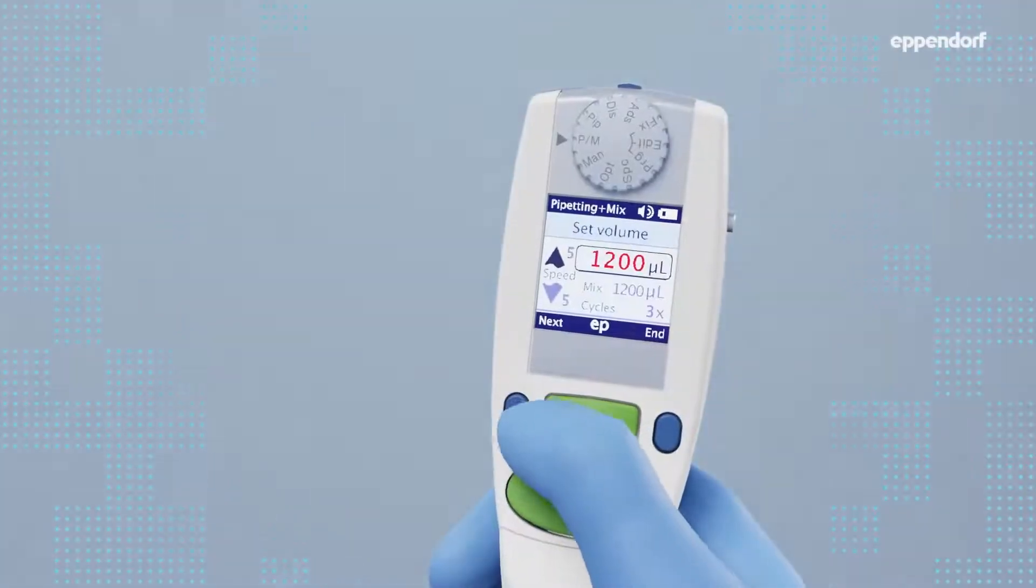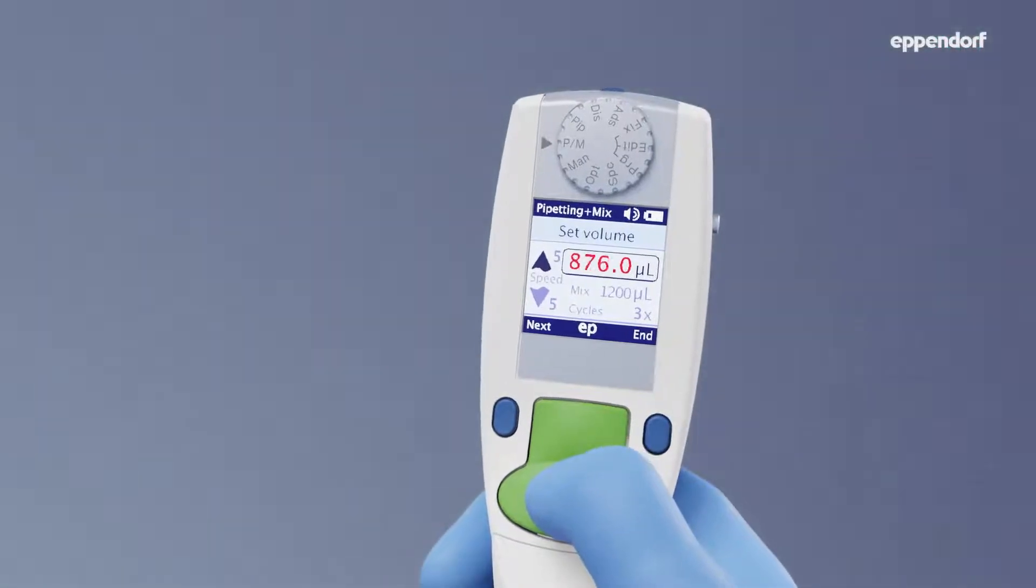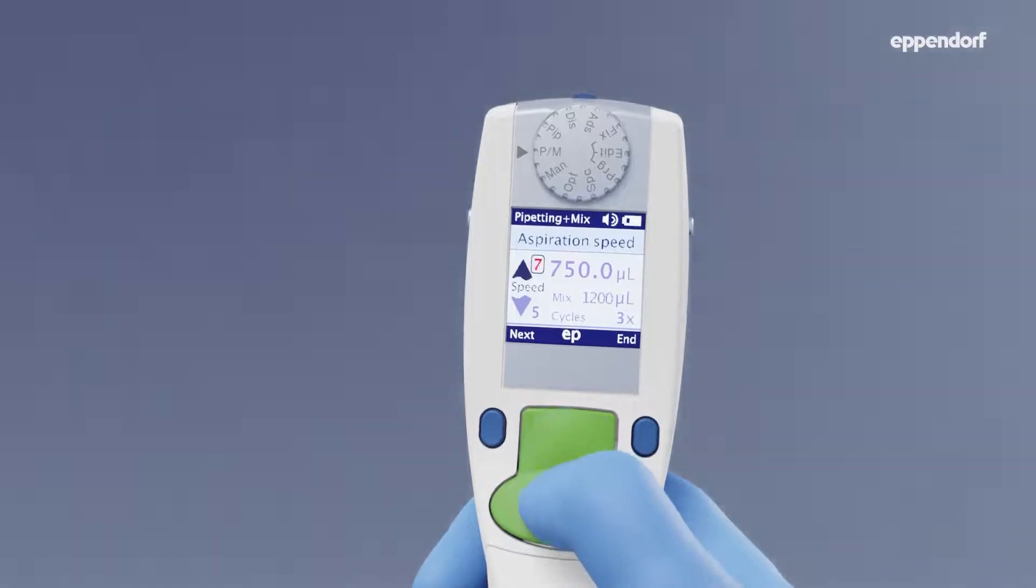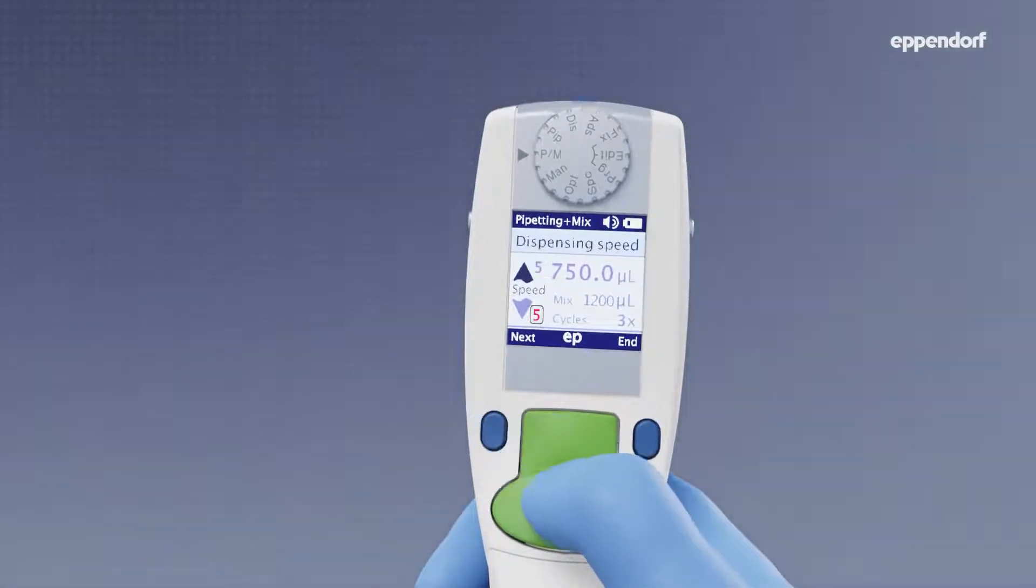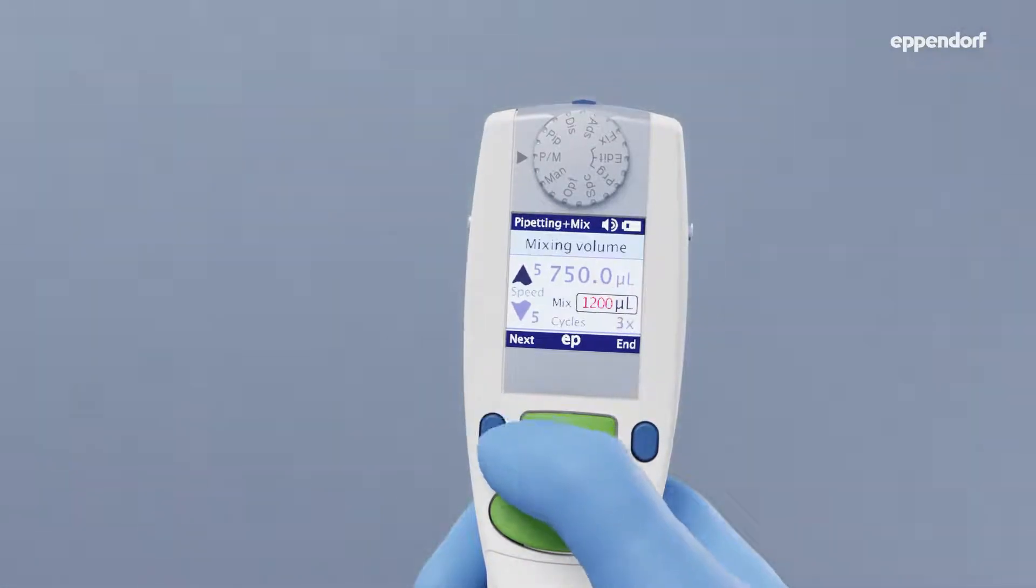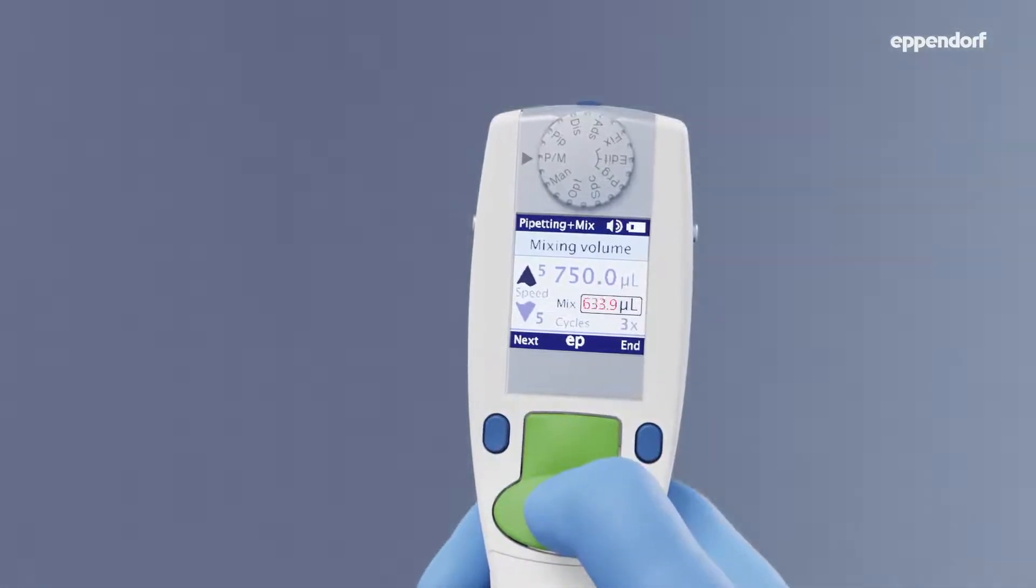Depending on the individual technique used, pipetting and mixing with mechanical pipettes can result in lower reproducibility. With fixed pipetting speeds and mix cycles, electronic pipettes minimize the variability different pipetting practices may introduce. With Eppendorf Xplorer pipettes, even the mixing volume may be individually set.